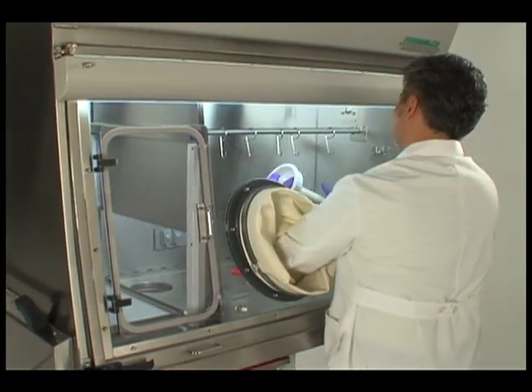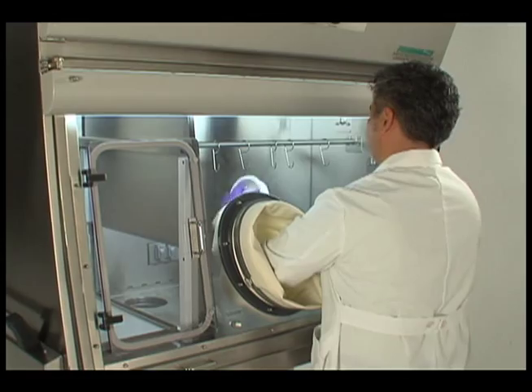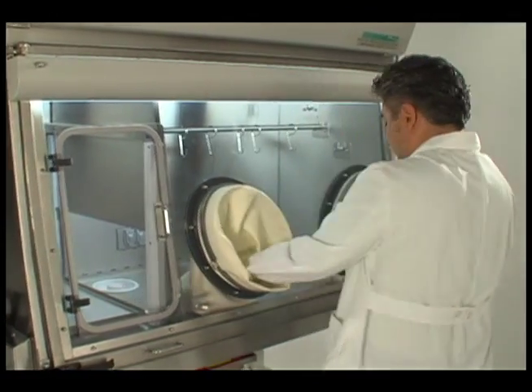Lift the waste chute cover from the work surface and unscrew the post. Set the post aside and place the waste chute cover back over the work surface.